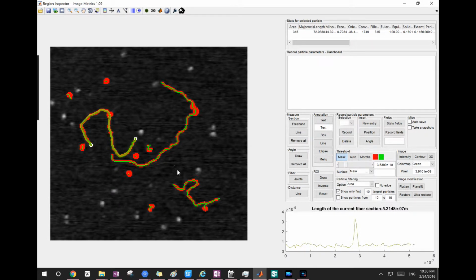So here is some convention. Once you click the DNA and the program makes the trace, you see the profile in the axis at the right bottom corner. This is the profile of the DNA trace.